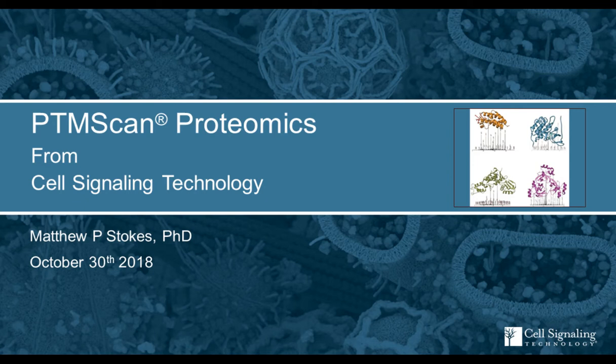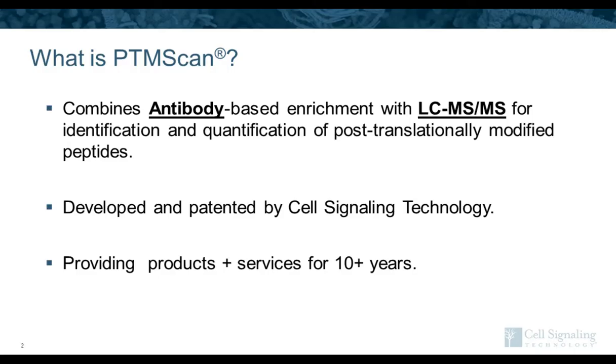Okay, welcome everybody. Thank you for joining us today. This is Matt Stokes. I'm going to give a brief introduction to PTMScan proteomics and then turn it over to Birgit to talk about her work. So when we talk about PTMScan, it's really just the combination of an antibody enrichment with liquid chromatography, tandem mass spectrometry to both identify and quantify post-translationally modified peptides.